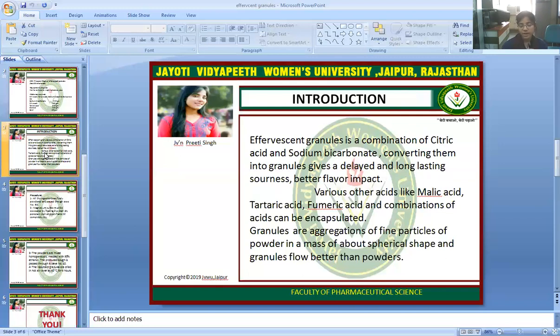For preparation of effervescent granulation, it has been found that citric acid monohydrate and tartaric acid used in the ratio of 1:2 respectively produce a powder with good effervescent properties. Citric acid monohydrate is not used alone because it results in a sticky mixture that will not easily granulate. So, this is the complete protocol of the practical.